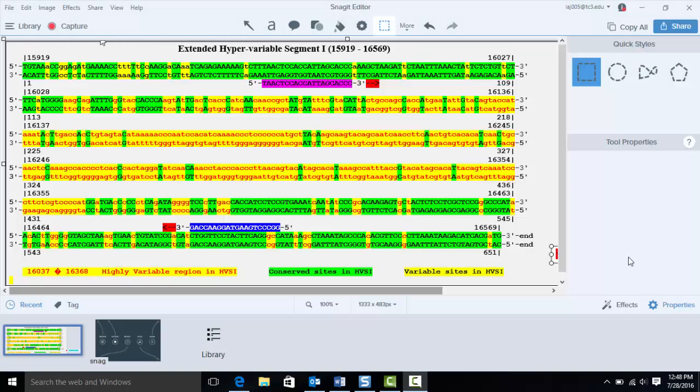I'd like to remind you of what you're looking at when you are working with your DNA sequence. Let's recall from day 1 of our lab that through PCR you amplified a segment of your mtDNA called the HVS1 segment, and to do that you used two primers, a forward and a reverse. Now your DNA is double-stranded, and the forward primer matched the sequence in your reference strand. Therefore it bound to the complementary strand. Then DNA polymerase extended the primer in the 5' to 3' direction by adding bases at the 3' end. And this gave us a copy of the reference strand.